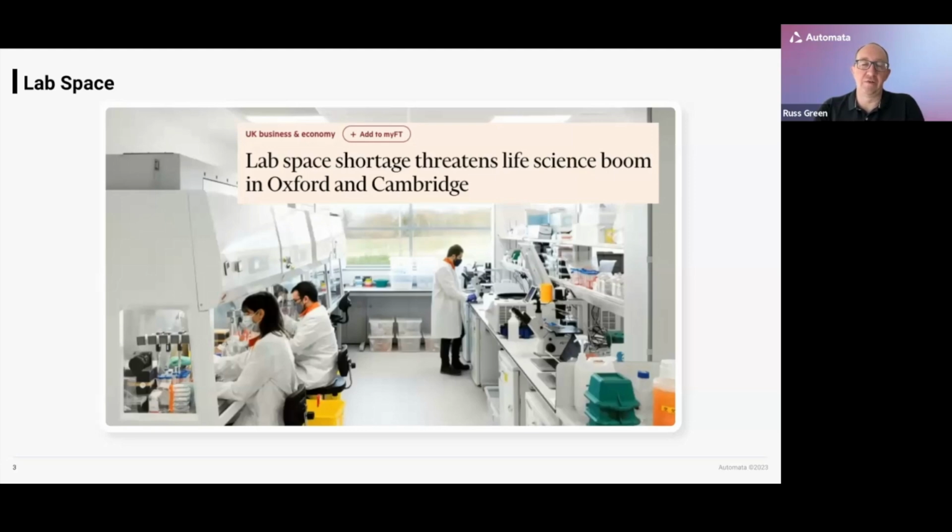The reason why I raise this in the context of automation is that one of people's first reactions to automation is, I need to make space for this to happen. Something has to change in the space that I have to be able to place automation within it. And I want to challenge that ever so slightly. First of all, that may be true, but it also may not be true. I think one of the things that automation can do is really unlock the potential of a space that you already have, as you'll see in some examples later on, and perhaps even maximize your output so you get more experimentation done per square meter than you would be able to achieve without automation in place.